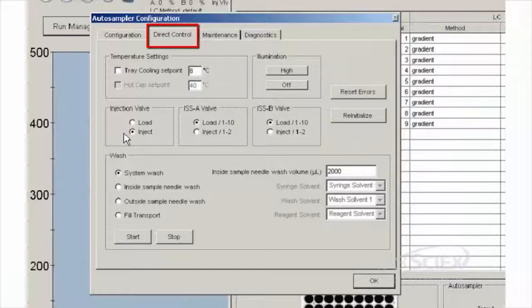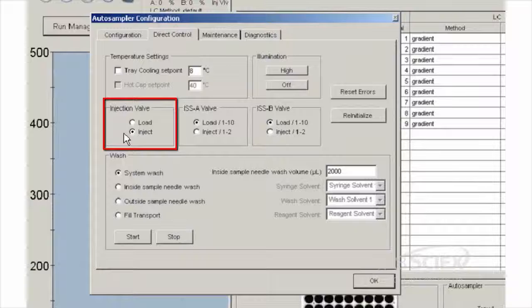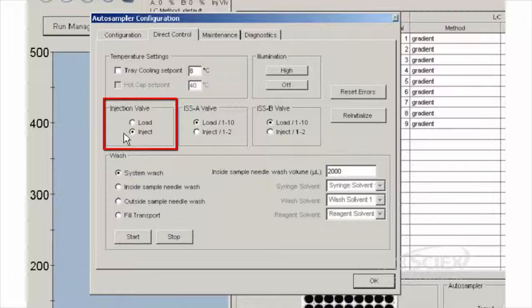Using the Auto Sampler Configuration window, click the Direct Control tab, Injection Valve Group, and switch the valve position between inject and load ten times to set the valve stops.